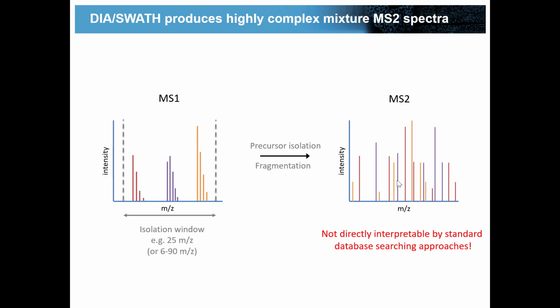I guess the standard fragment ions can come from isotopes of non-monoisotopic precursors. Yes. And it was actually discussed in the original SWATH paper, but that's sort of ignored all that. Yeah, but we still do it. But there's another reason, right? So you can also score.